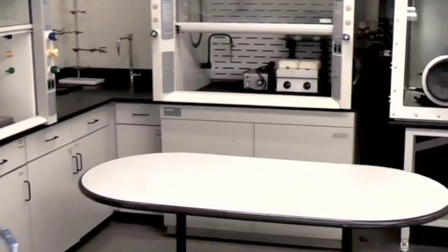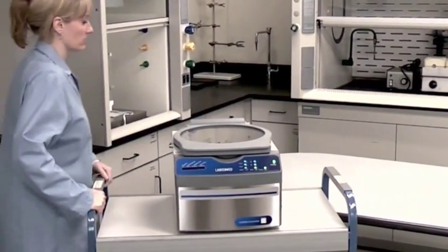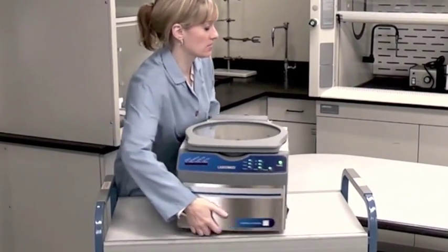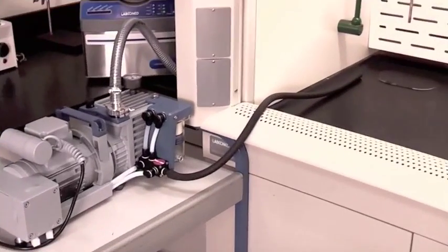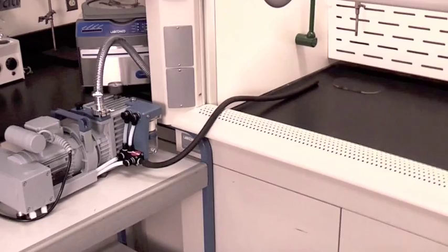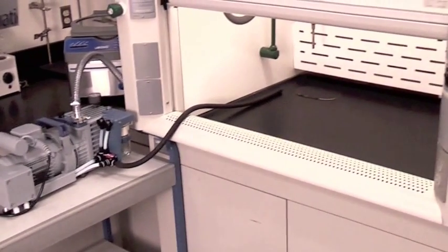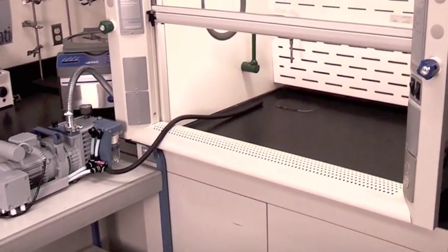Once you have the correct electrical configuration, find a location that will accommodate each component of the Centravap system. You can use a lab bench or mobile cart for these items. Venting the vacuum pump to a fume hood is recommended to prevent vapors that are being evaporated from entering the room.